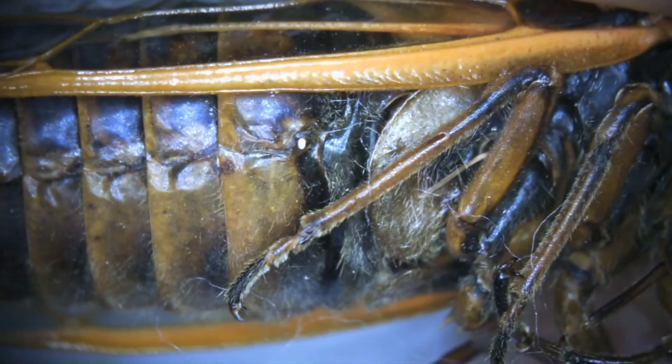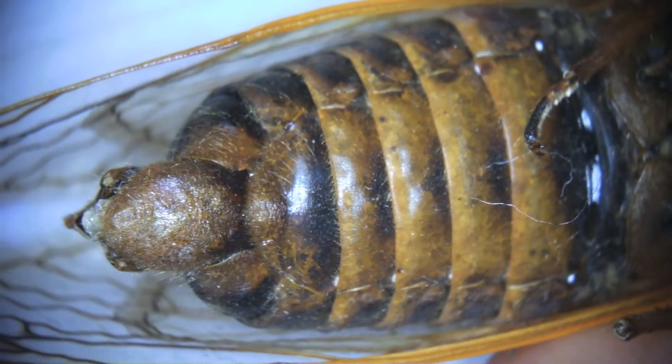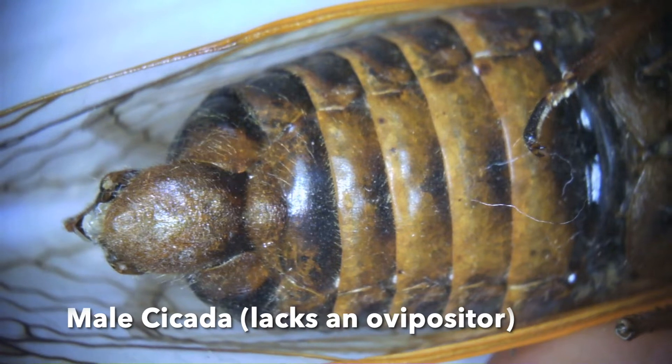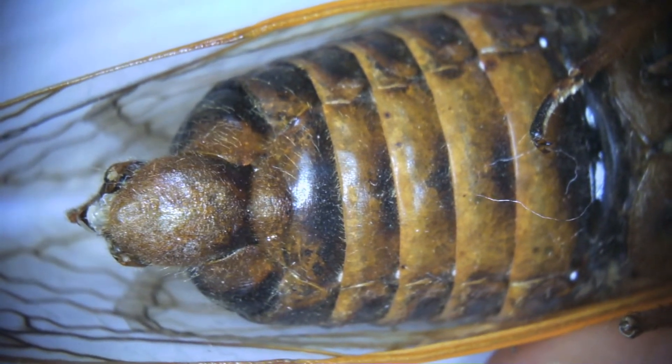Completely harmless, but it's just a male saying hey, I'm trying to find a mate. Then we can see that this was in fact a male by looking at its rump. Here we have the abdomen, which is that third and final body part.